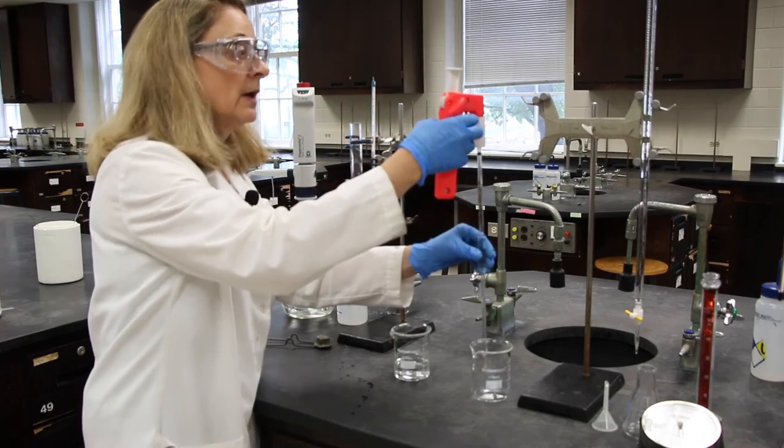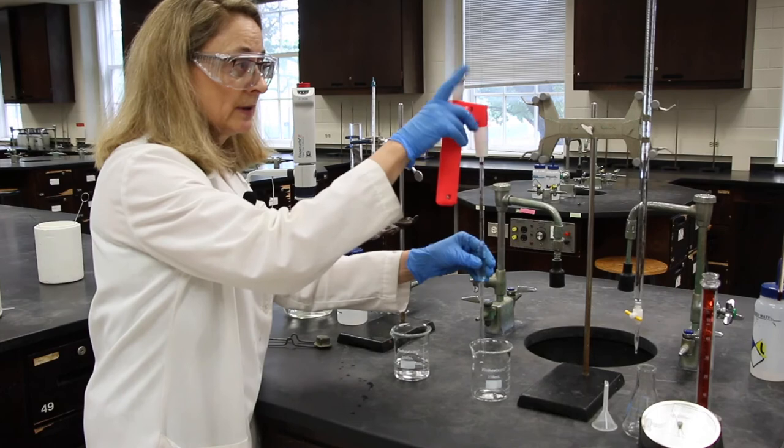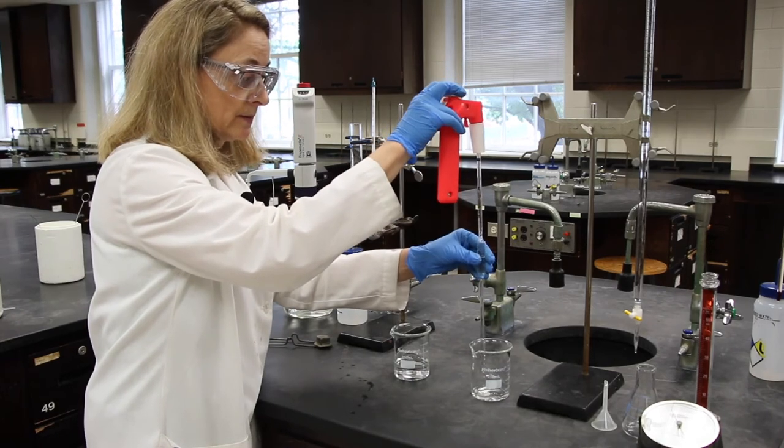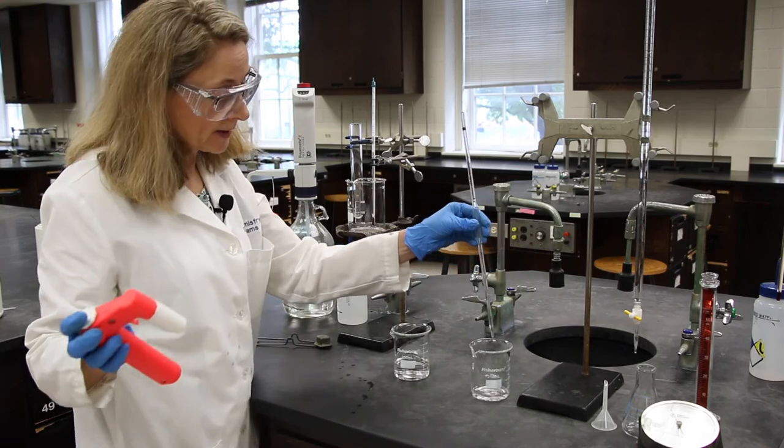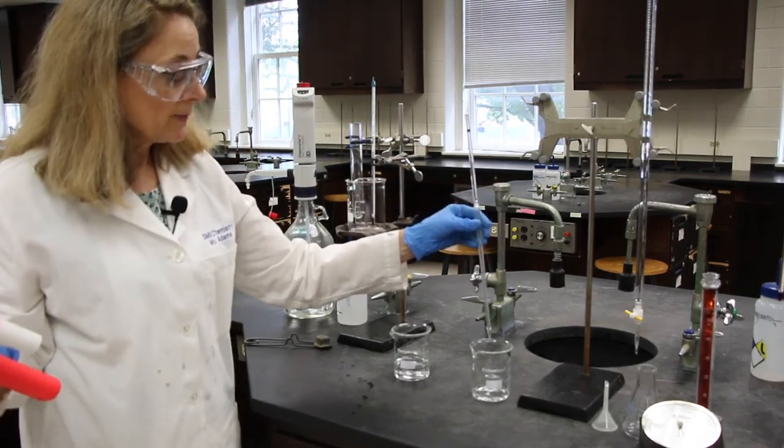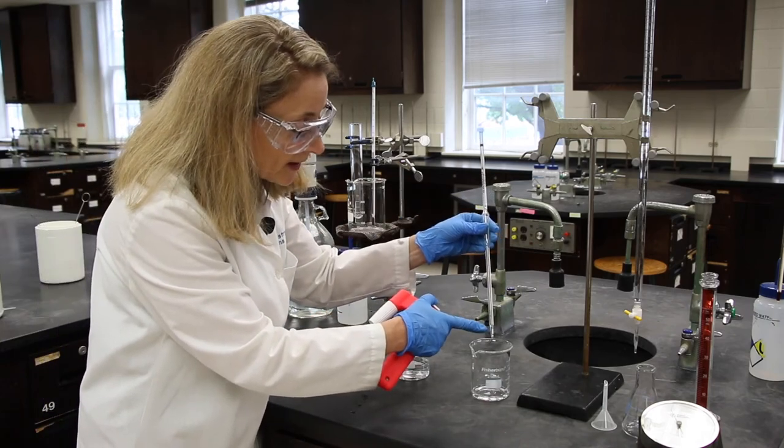And then either there's a lever or the top you can push down, or you can even remove the auto-pipetter. These pipettes, you may still see a little bit on the inside, they are calibrated to deliver.